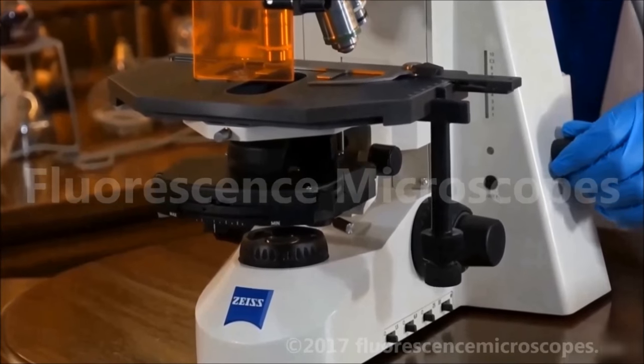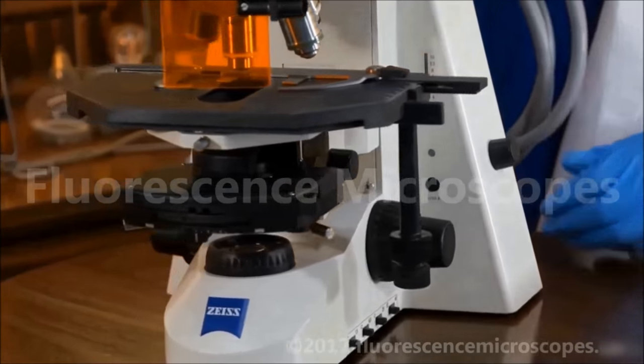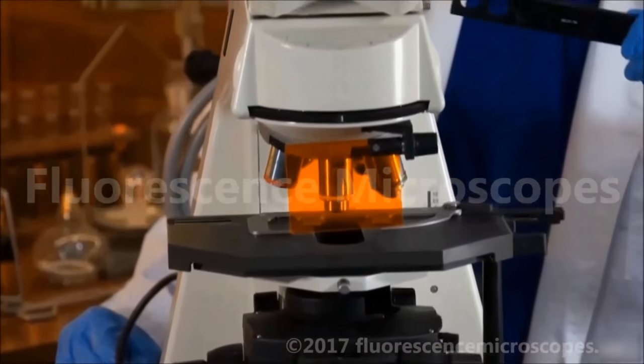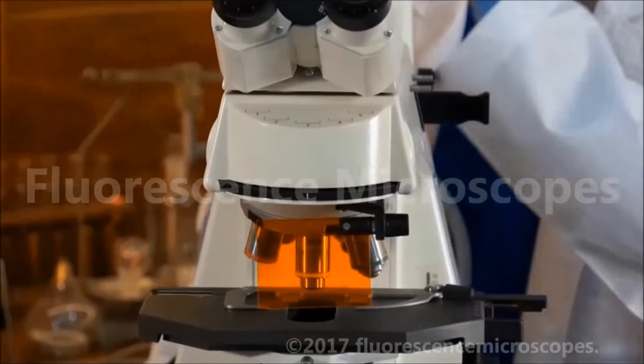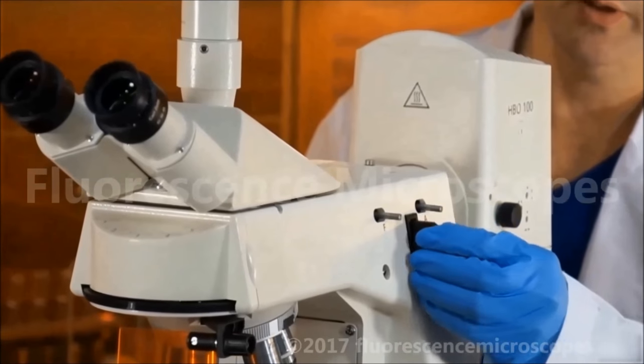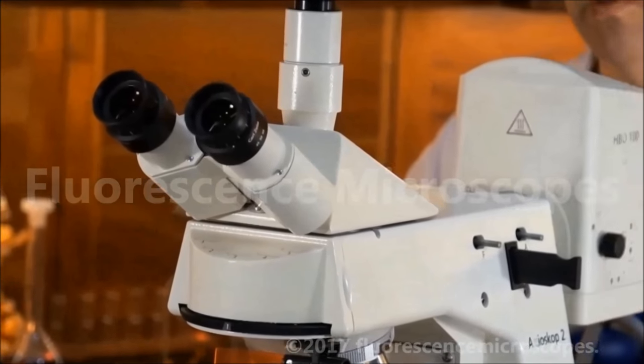This is your variable intensity on your halogen illumination. You have a filter slider. This acts as a shutter for your HBO lamp, and it also has a filter that you would normally use when you're using your HBO lamp.